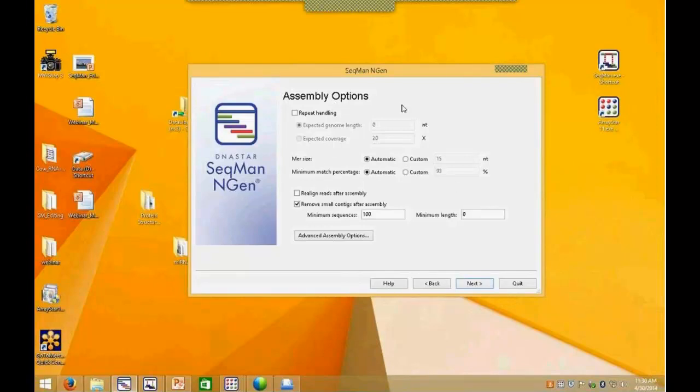Of all the parameters that we have here for microRNA, I oftentimes will increase the minimum match, and that is the percent that the read must match the consensus within that contig in order to align and cluster. Because microRNAs can be quite similar to each other, I might make this more stringent and say 97%. I want a stringent, clean contig with little mismatch.